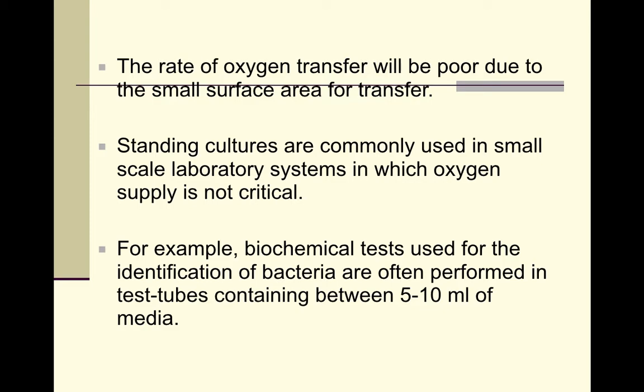The stirring of this culture not only provides the oxygen to be mixed well, it also mixes all the nutrients of the culture medium very well, makes it available for the organisms, and also helps the dilution of the waste products that are released by the microbe.